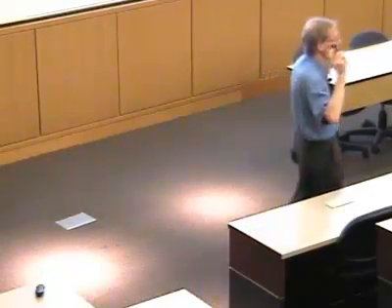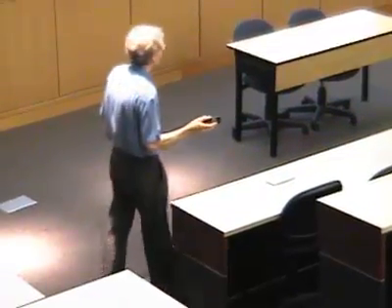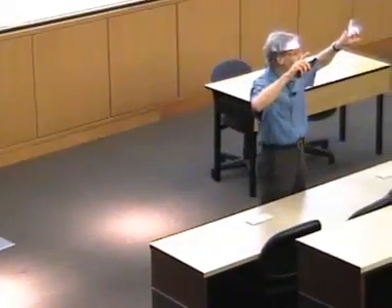It's a bulk thermodynamic measurement. There are a lot of things going in, and you've got to be a good scientist to be able to extract useful information. Now, this frustration: if you're frustrated, call me. I'm going to give you my cell phone number, and I'll talk you through it. I want people to get as much out of this technique as they can, but we've been frustrated. The first experiment we did, I think, involved iron, and we precipitated rust inside the cell. Oh, what a mess. And the guy who owned the instrument almost shot me. It was like a disaster.